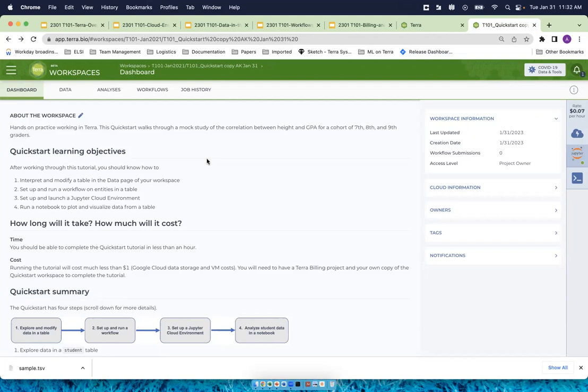I don't think so, but maybe one of the TAs can chime in with a more specific answer, like that you can create an identical environment within Terra. Yeah, I think maybe Samantha's answered this question in a previous session that we've had, but I don't believe if you have a current Google VM that your team is sharing, you can plug that VM into Terra. Okay. That's right, we're in the right ballpark, but I mean more than a VM. I mean an entire environment, right?